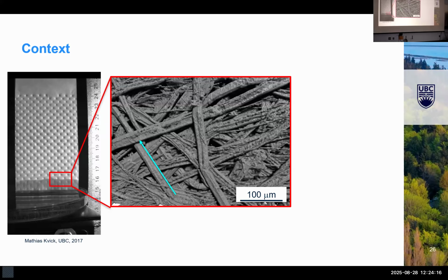As I mentioned before, there are all these different pore systems, so it could be going predominantly on the outside of the fiber, primarily through the fiber lumen, or filling up these interfiber pores, or traveling through the intrafiber pores in the wall. And again, it's a controversial topic, and nobody can really agree on why or how it does that.